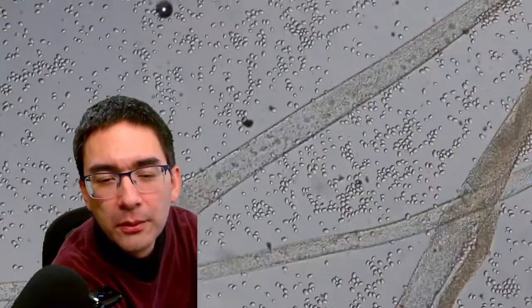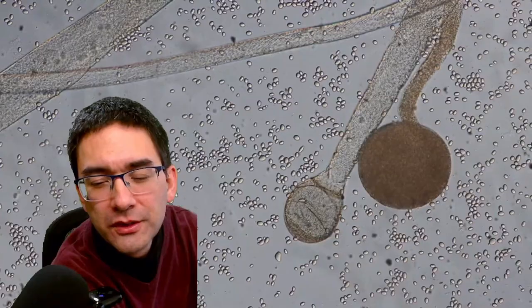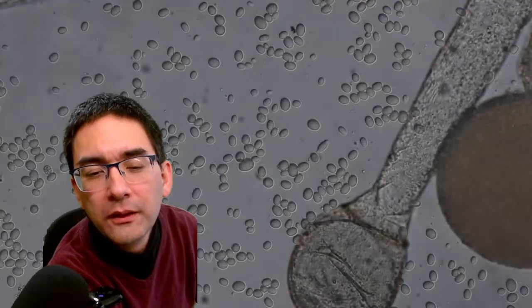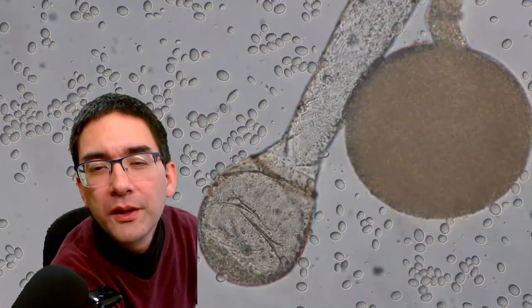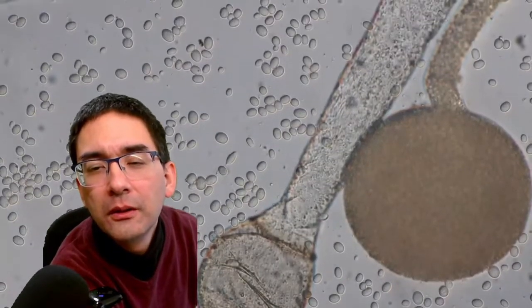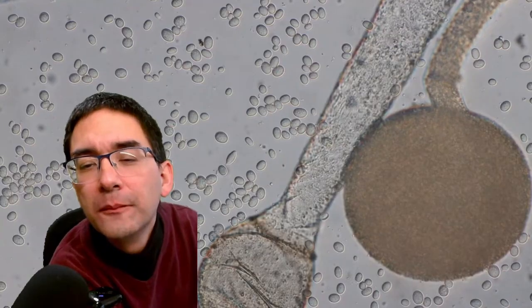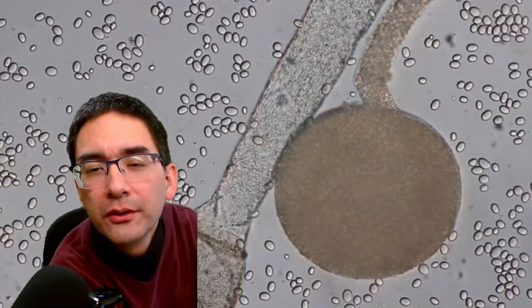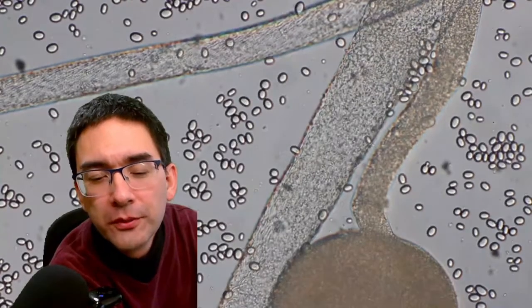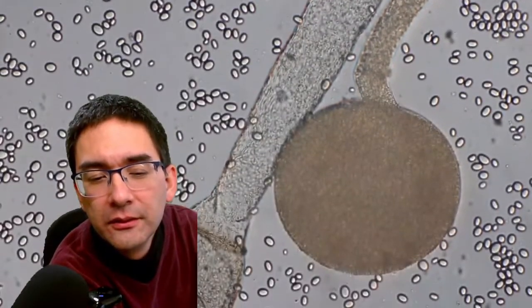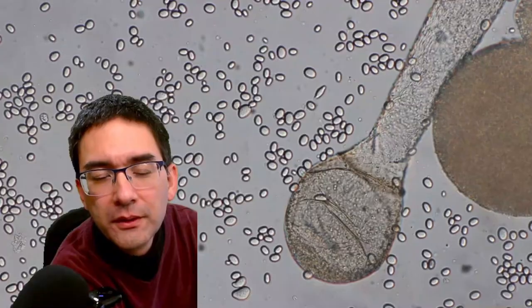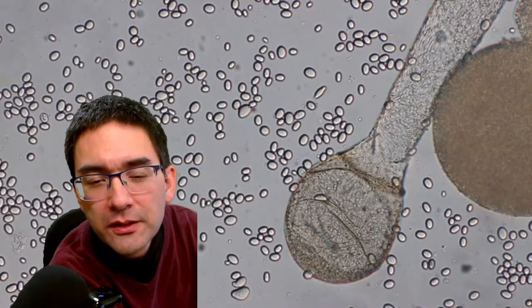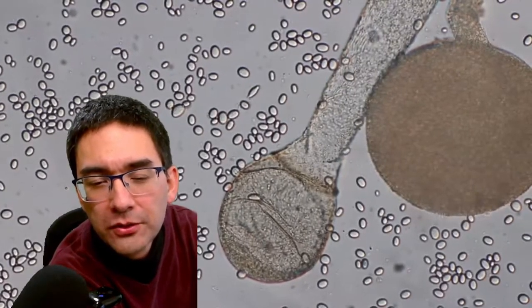You know what, just for the fun of it, let's go up a little bit with the magnification here. So this is now 20 times, 40 times objective. I got to go up with the light intensity a little bit here. Here we go. They look kind of different. I wonder why this is. Maybe it's a question of maturity that maybe some of them are not quite ready yet. There seems to be something flowing out here. Could also be because of the pressure of the cover glass. But that is quite nice to see here.